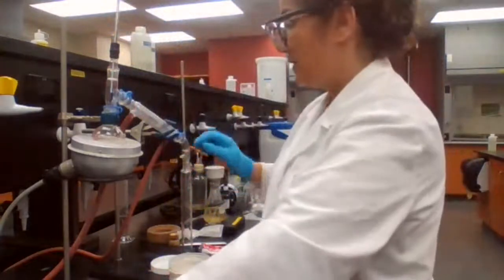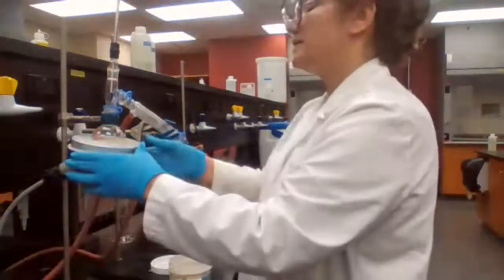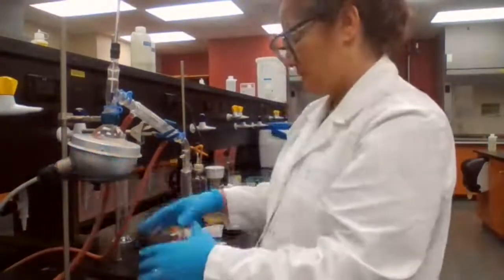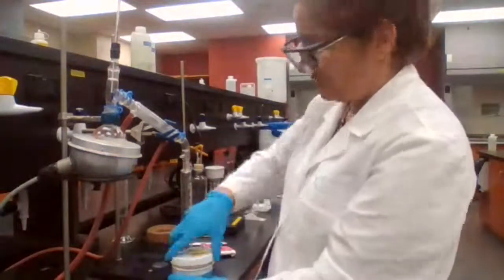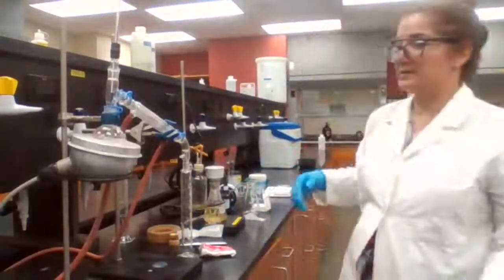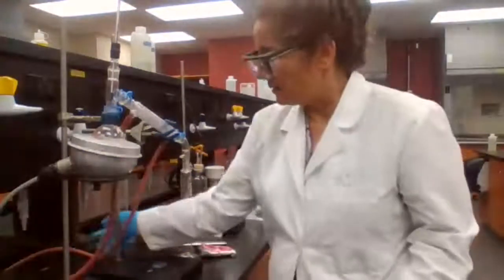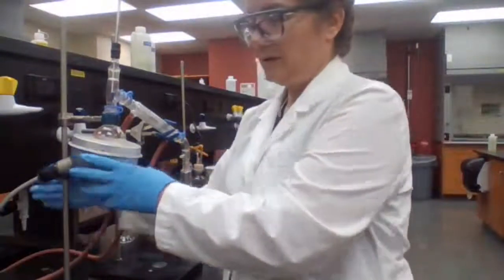Now, turn on the heat and wait until it's boiling. And we want to receive about 30 to 35 milliliters of the distillate. Okay, need to connect the water hose, connect the heat, turn on the heat.